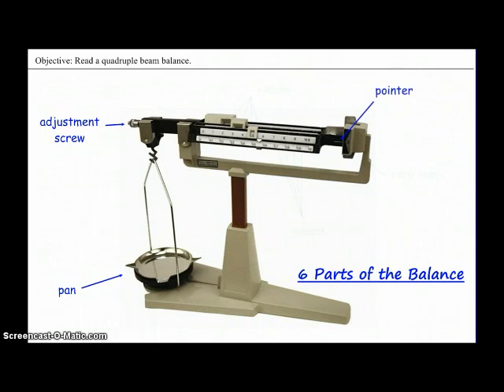On the right hand side of the arm, we have a white line called the pointer, which matches up with the zero mark, which is also a white line. When the balance is properly zeroed out, both of these lines should be equal.